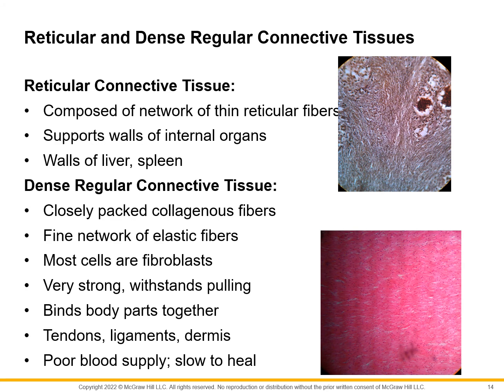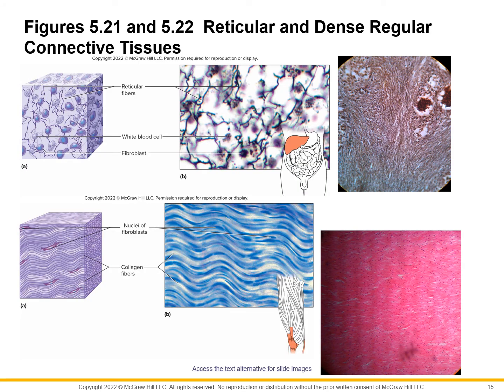All right. These are the pictures that they have from the book. Again, I just wanted to make sure you see there's a big difference. And for someone to be a histologist, they're already a medical doctor and go to extra training for years to learn how to do this. So understand, I just want you in lab to identify my pictures. And on the lecture test, there's not going to be pictures.